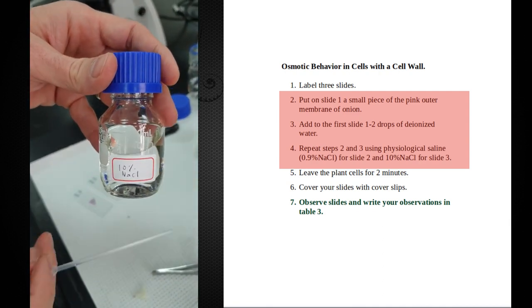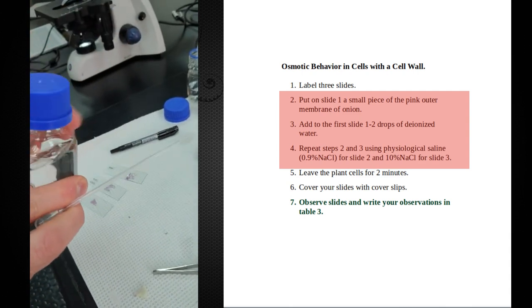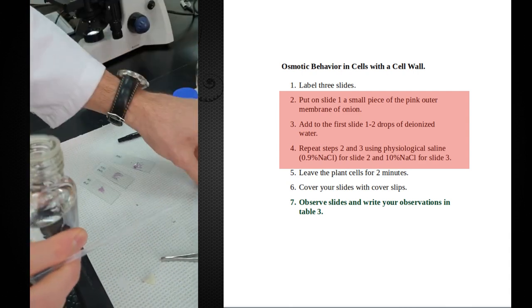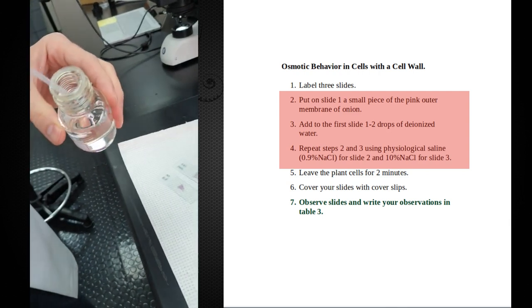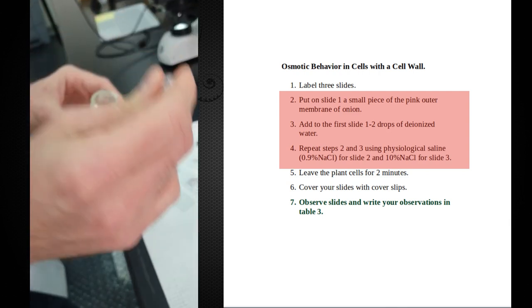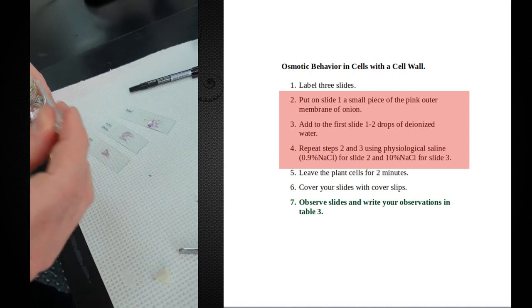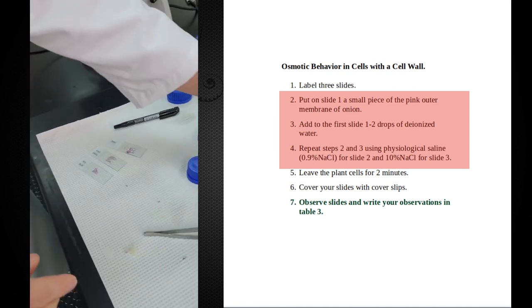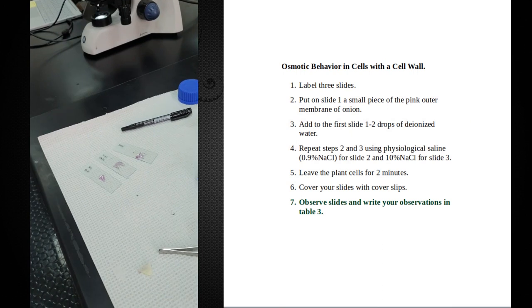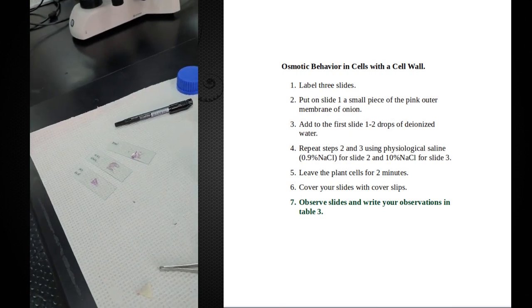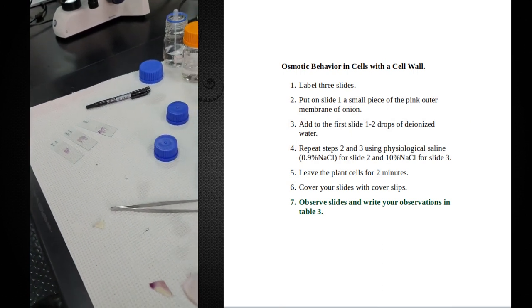And 10% salt. That's a pretty highly concentrated salt solution. So we're going to see how this affects plant cells and what they actually look like under the microscope. And again, the fact that we have nice pink cells that we're starting off with, we're going to be able to see their cytoplasm fairly clearly on this.